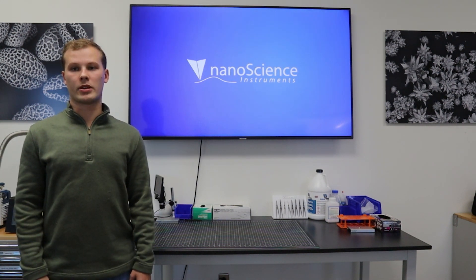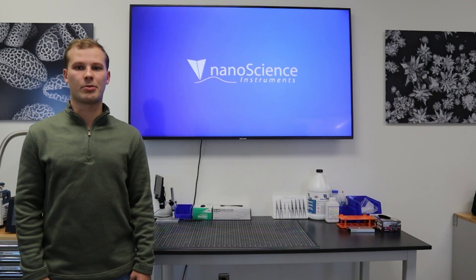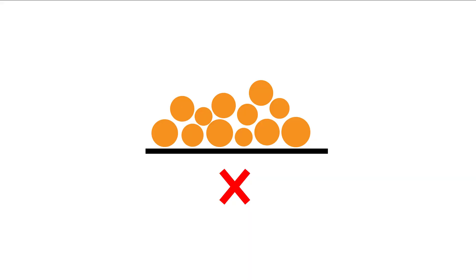The previous videos in this series have stressed the importance of proper sample preparation for ideal SEM analysis, but this is even more critical for dry powders. Powders are incredibly small and easily clumped together when simply deposited onto an aluminum stub.